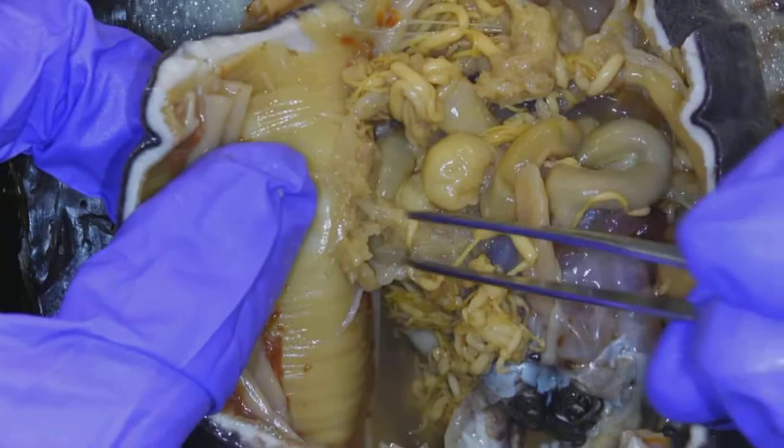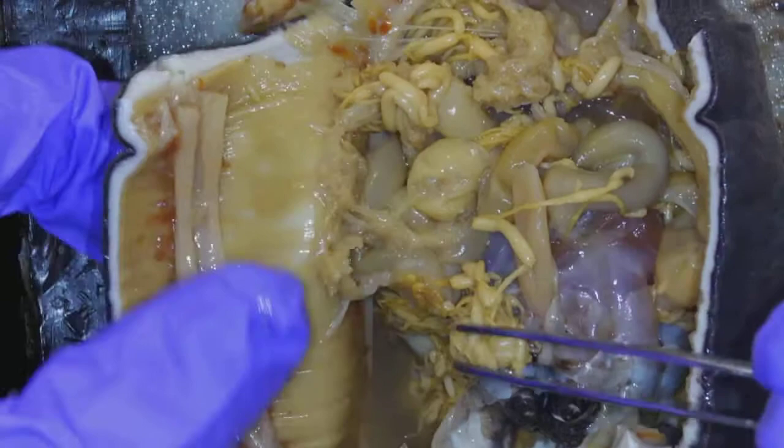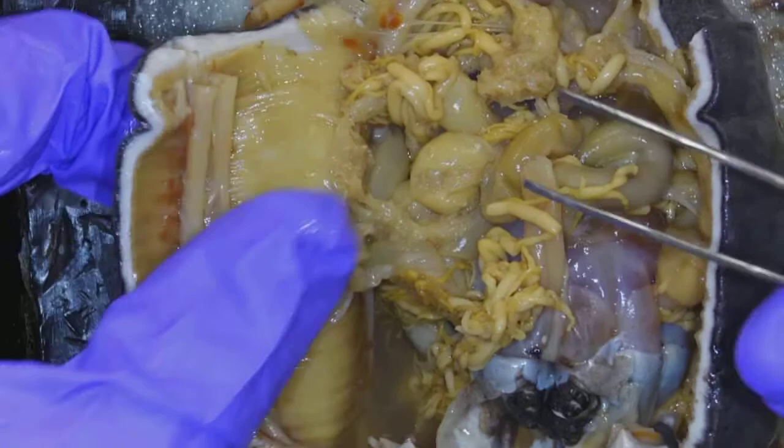Going back to the animal — which one was the respiratory tree? It was this pale yellow stuff here. So this structure here is the respiratory tree. That means the other noodley stuff are the gonads — gonads wrapped around that respiratory tree.